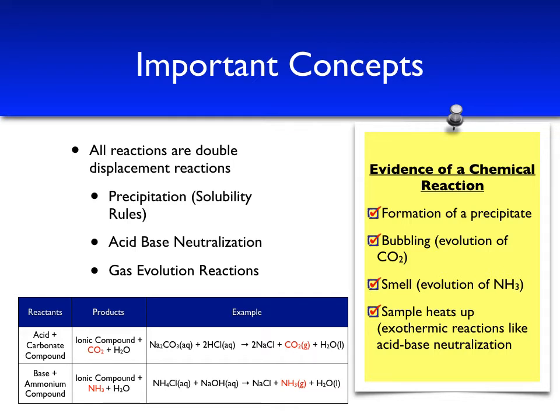We also will look for bubbling. In this experiment, bubbling is evidence that carbon dioxide gas has evolved from the solution. Carbon dioxide is not as soluble in water as many other things, and therefore bubbles quickly out of solution upon formation of an excess amount.